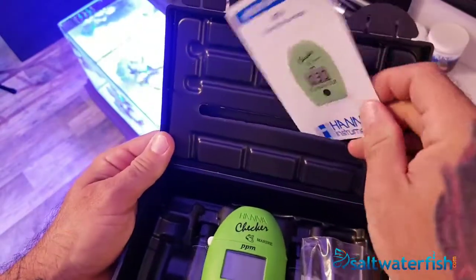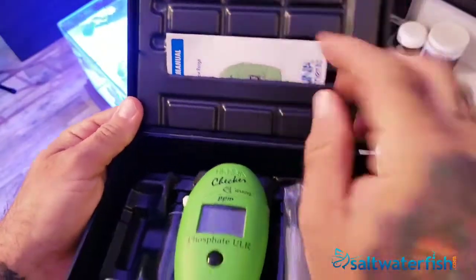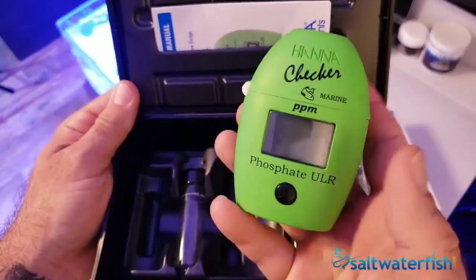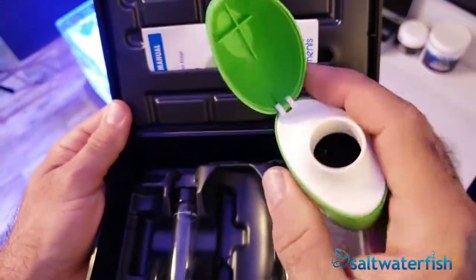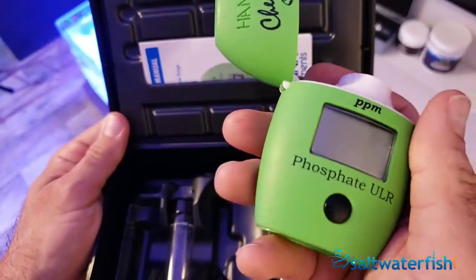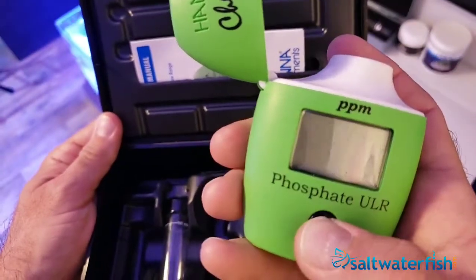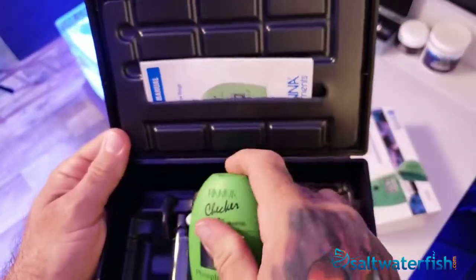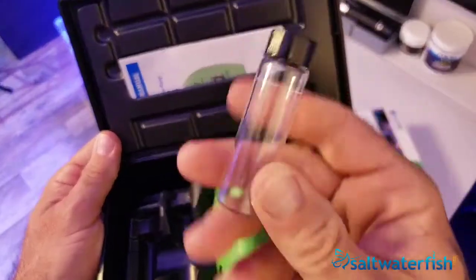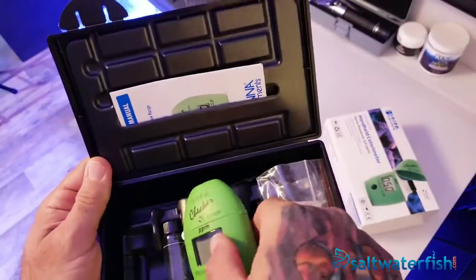Testing for phosphates is standard practice for marine aquarium keepers. The Ultra Low Range Phosphate Checker by Hanna Instruments provides useful insight into an aquarium's water chemistry. Though phosphates are one of many forms of phosphorus compounds that occur in natural seawater, excessive phosphate levels can inhibit skeletal growth of many coral species. Small polyp stony corals such as Acropora are exceptionally sensitive to high phosphate levels.